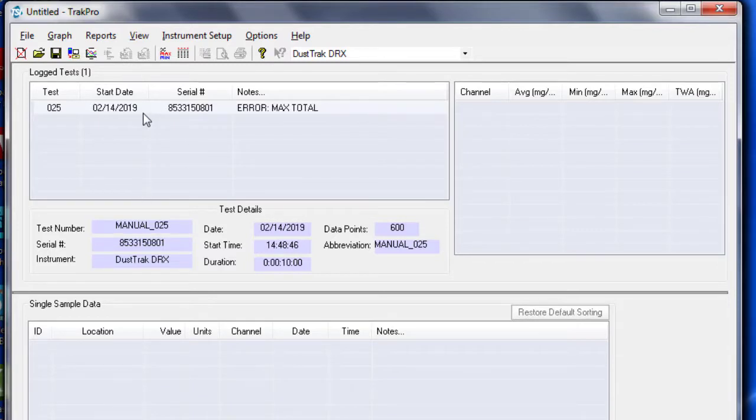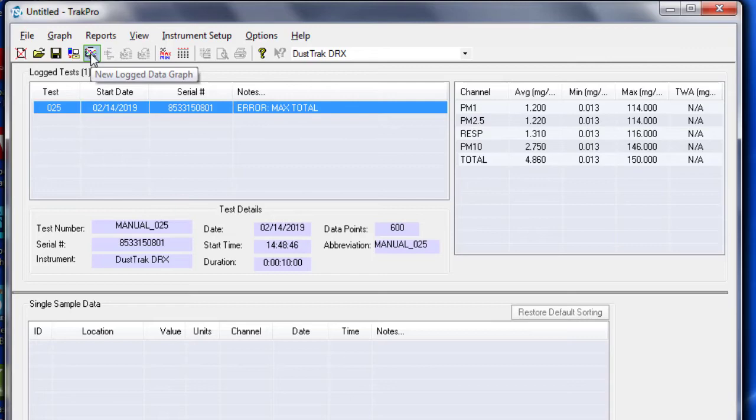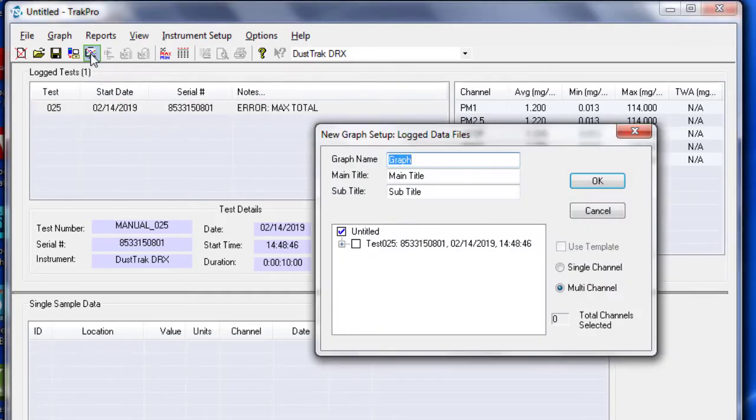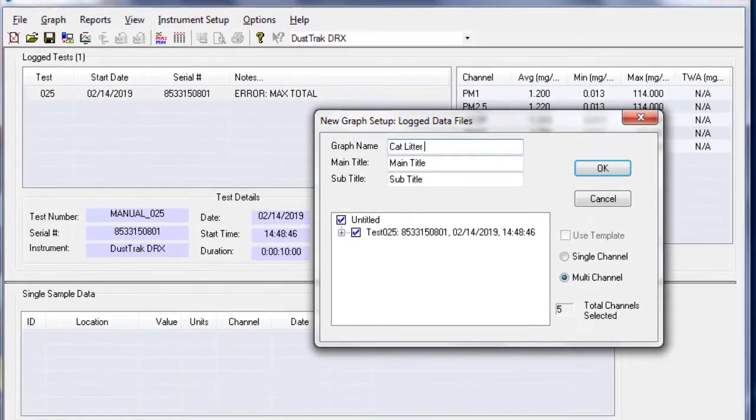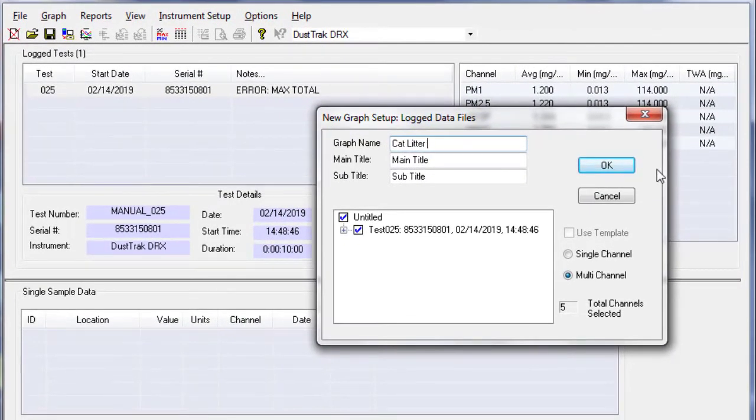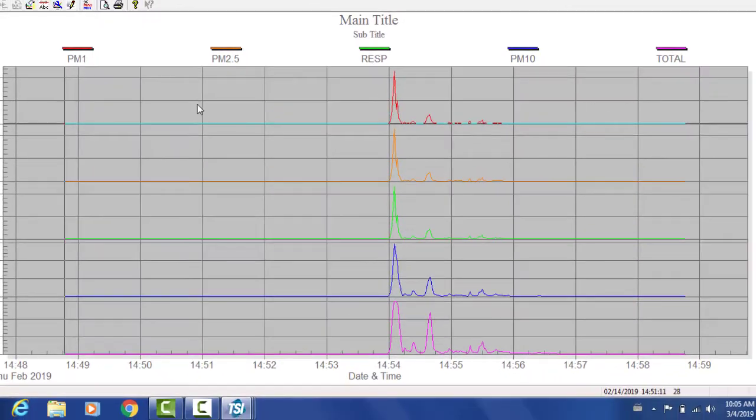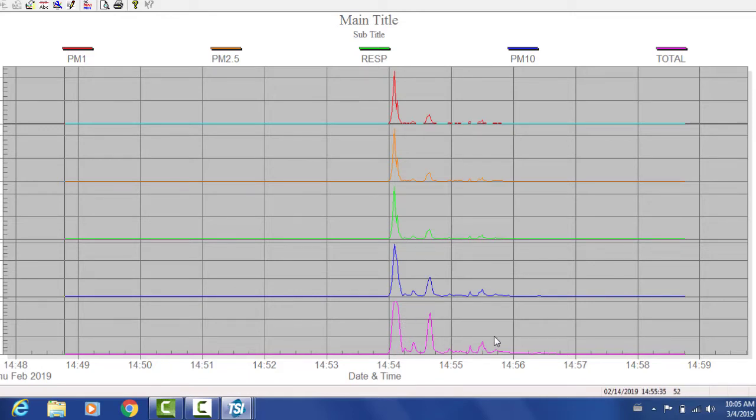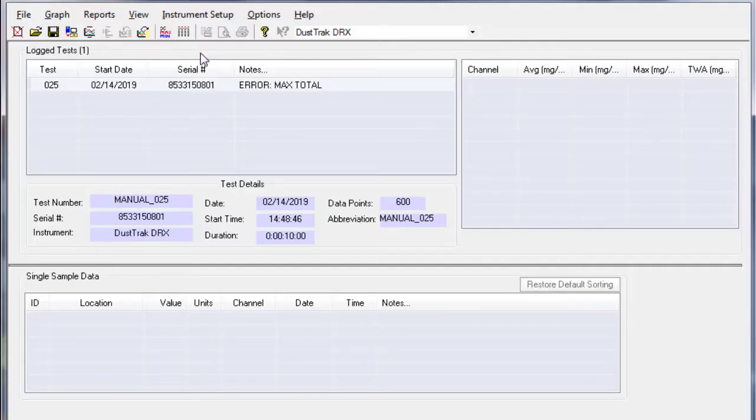Within the software, you can also graph your data. There is a shortcut for this and you can also find it on a tab next to file. I am going to rename my graph. Select the data that I want to graph. And here is how the graphs look. So each mass concentration fraction is displayed using a different color. So there's graphs for PM1, PM2.5, respirable fraction PM10, and total mass fraction.